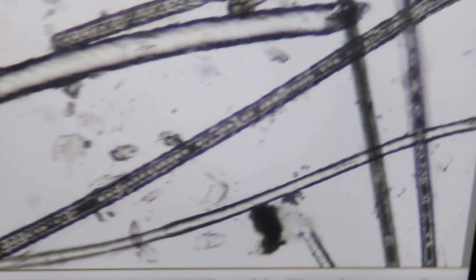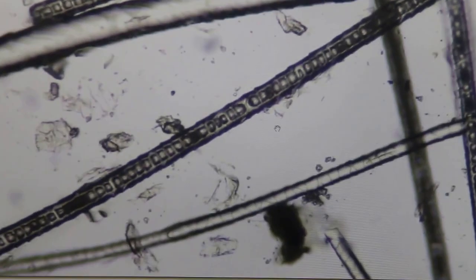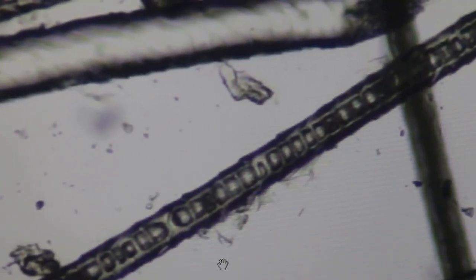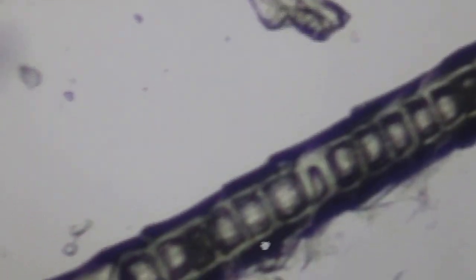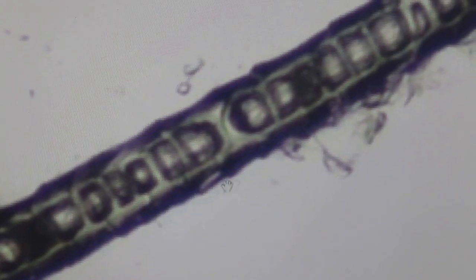So now we will show how we use the microscope. What is this then? The normal dog's hair. This is a Pomeranian hair with fragmented medulla. As you can see, this is normal. Now the cuticle - the cuticle is intact. There is no outpouching. Is there any outpouching of the spores? Outpouching of the cuticle? Let's examine closely.